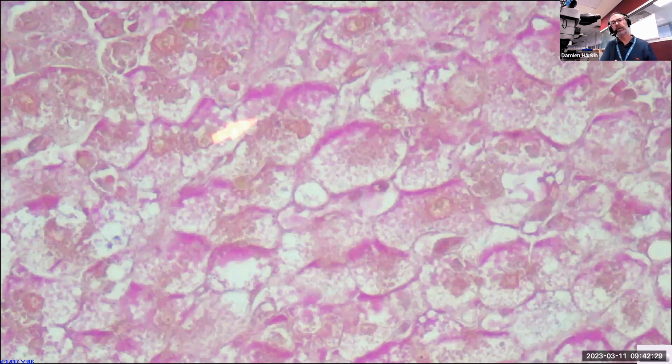So on this occasion, you would definitely do the Van Gieson last. There's no question about that, because of its susceptibility to being easily removed by rinsing. And so that's why we employ the blotting and the very quick dips in absolute alcohol right at the end prior to xylene as a way to retain those stains.